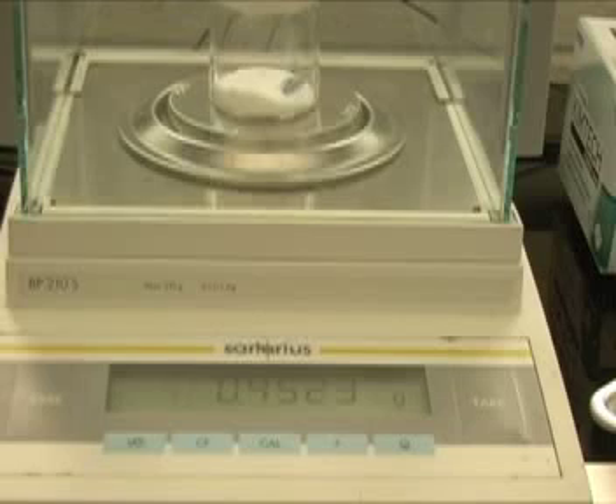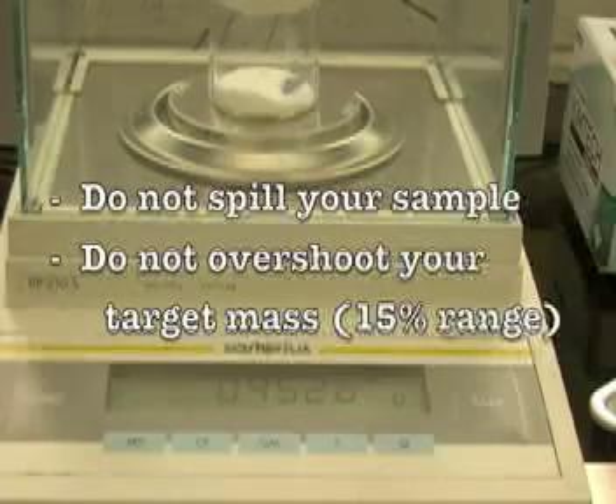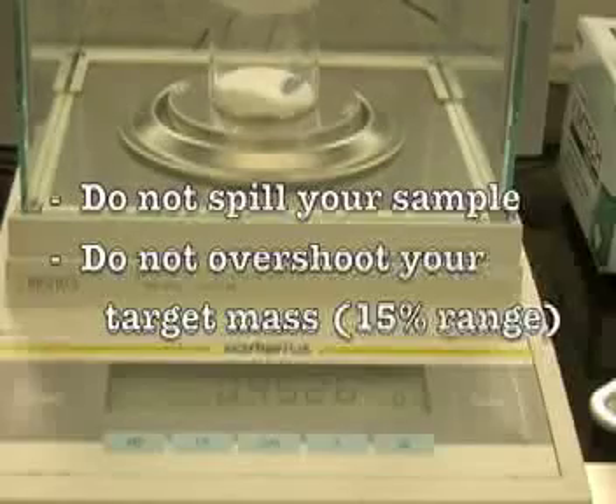Also, be careful not to overshoot your target mass. The mass transferred from your weighing bottle must be within a 15% range of what you were aiming for. If you overshoot your target, you cannot pour this amount back into the weighing bottle. Instead, you must start over with a new clean beaker.